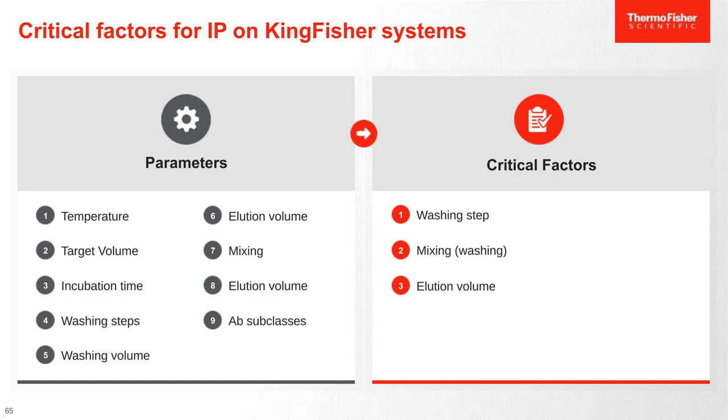yield. So we have then also performed the same experiment, but instead of staining all the proteins that are on the gel, we continued to do Western blotting to detect specific proteins that we have captured.